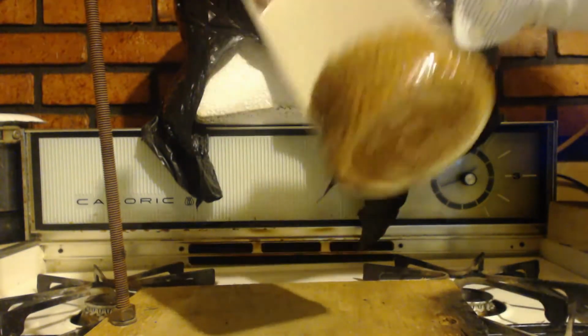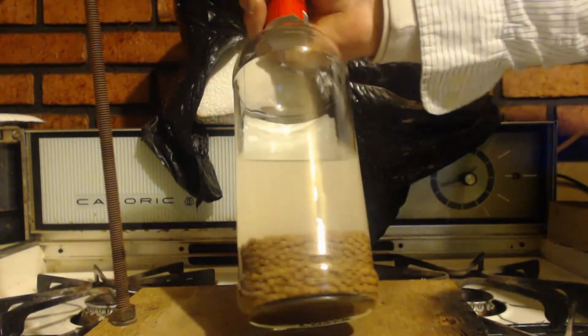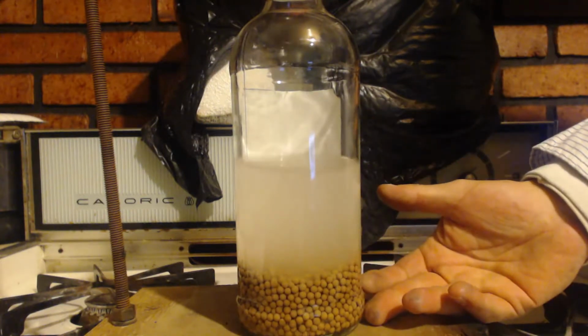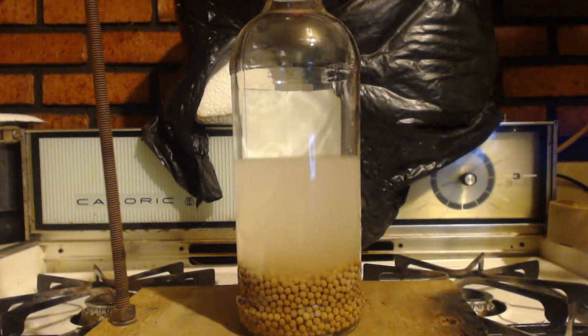Basically, you can either redistill this. You got particles of the molecular sieves in there, so you might want to filter it out. Or once it sits and drops to the bottom, you can just decant it. Whatever your thing is.